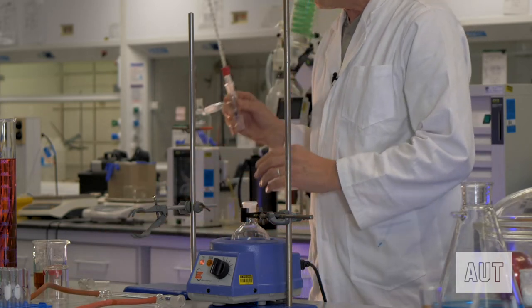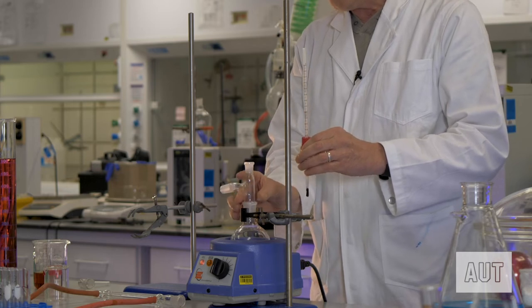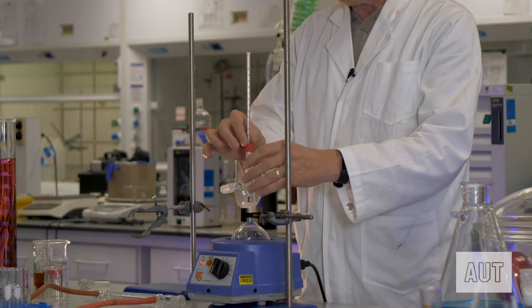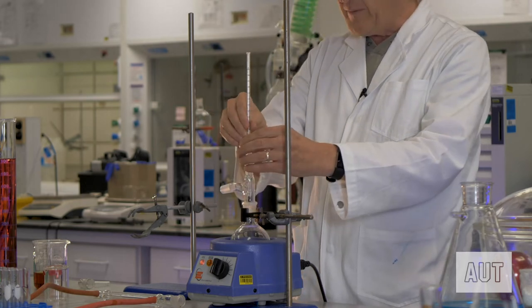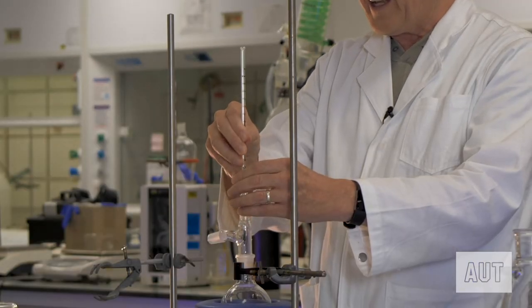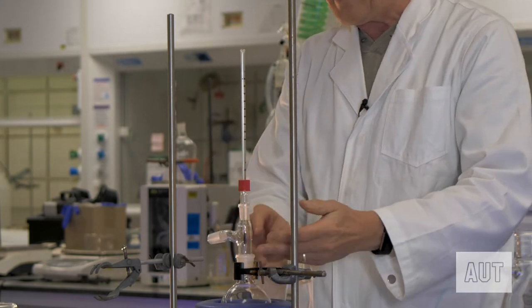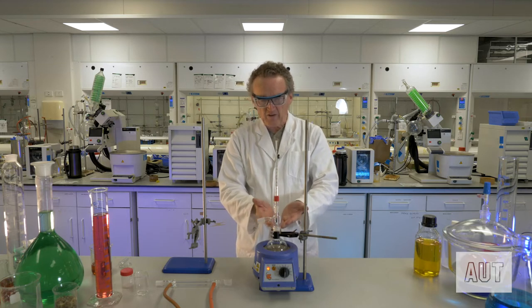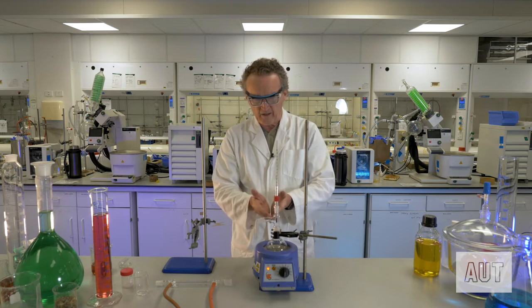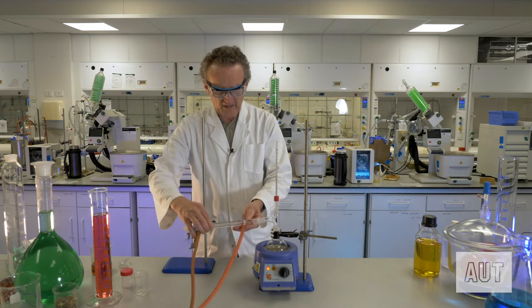We then take our still head, that goes in there like so. Again, our thermometer with our thermometer adapter goes in the top of the still head like so. Now, it's very important that you have the thermometer at the correct level in the distillation, and that level is essentially right at this point here. What that is going to do is measure the temperature of the hot vapor just before it starts condensing.